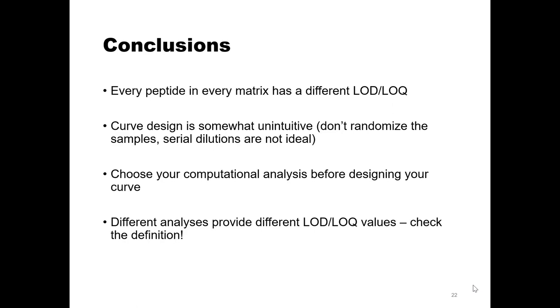Any questions on calibration curve design or all of these analyses? Is everyone mostly using %CV as their method? Anybody inspired to try Quasar or MStats now? Yeah. Yes. How often? Ooh, I think that's totally dependent on your experiment. How often do you do calibration curves?